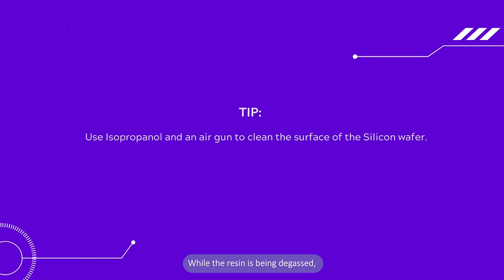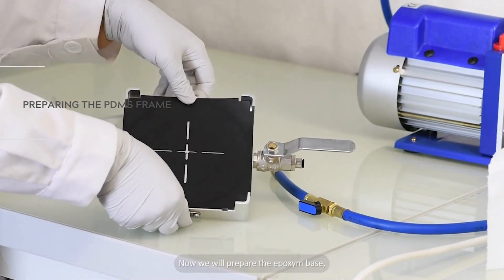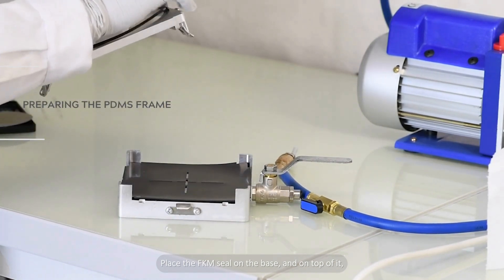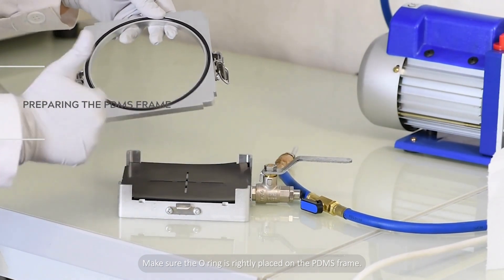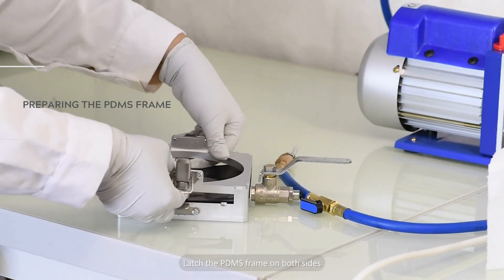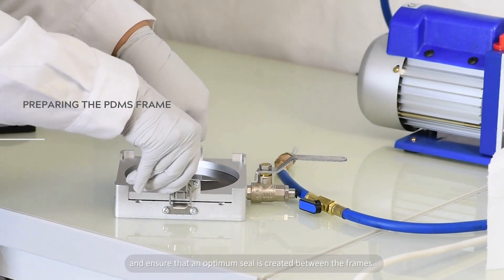While the resin is being degassed, we will clean the silicon wafer using isopropanol. Do keep in mind that the bottom of the silicon wafer is clean to avoid any PDMS leaks. Now we will prepare the epoxy base. Place the FKM seal on the base and on top of it, position the silicon wafer. Now we will prepare the PDMS frame. Make sure the O-ring is rightly placed on the PDMS frame. To assemble the frames, latch the PDMS frame on both sides and ensure that an optimum seal is created between the frames.